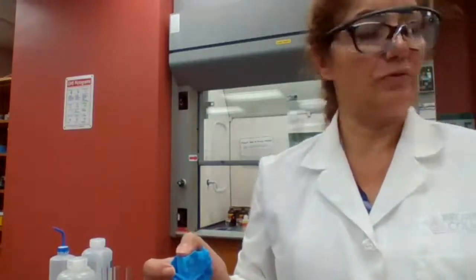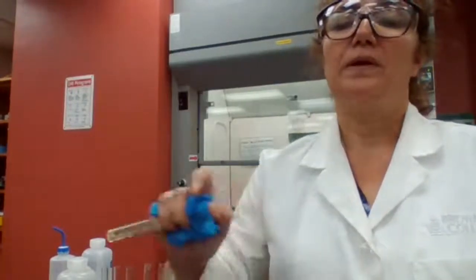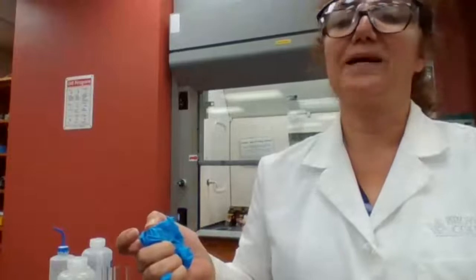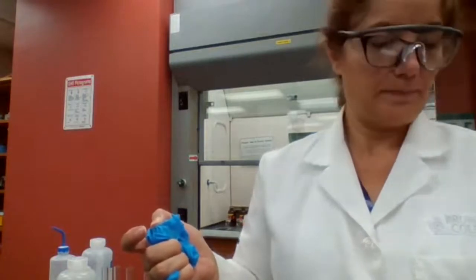All you do is look for the reaction between carboxylic acid and silver nitrate. You're changing the reaction from the product side to the reactant. So basically, if you're adding extra HNO3, it's going to shift the reaction back.